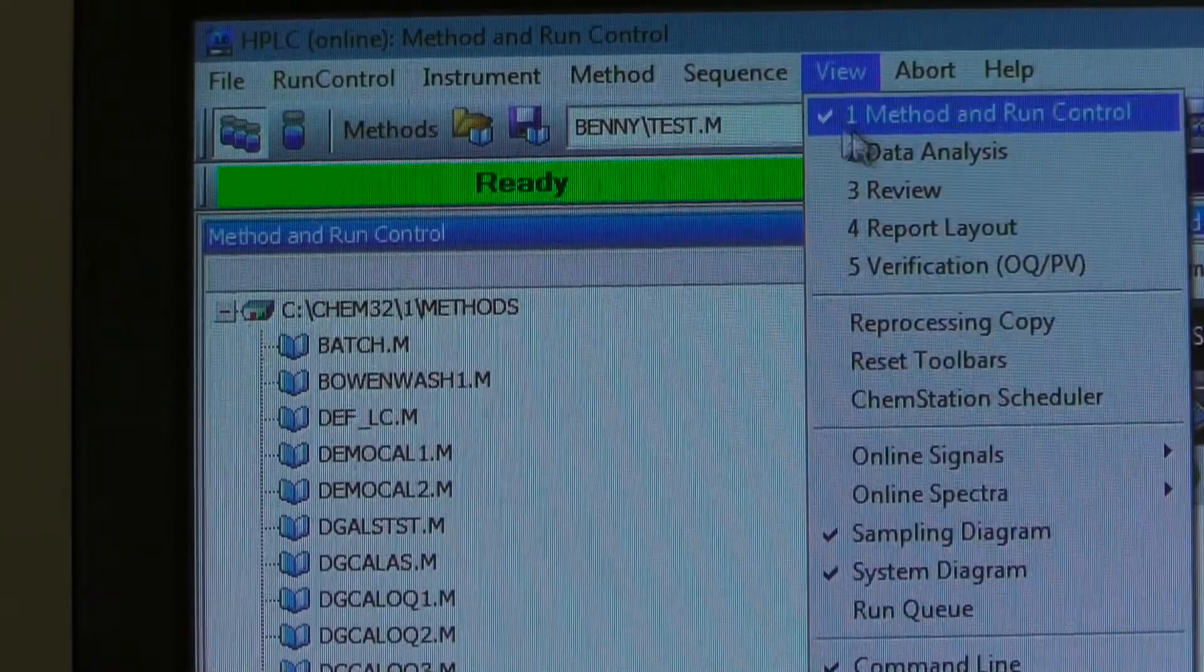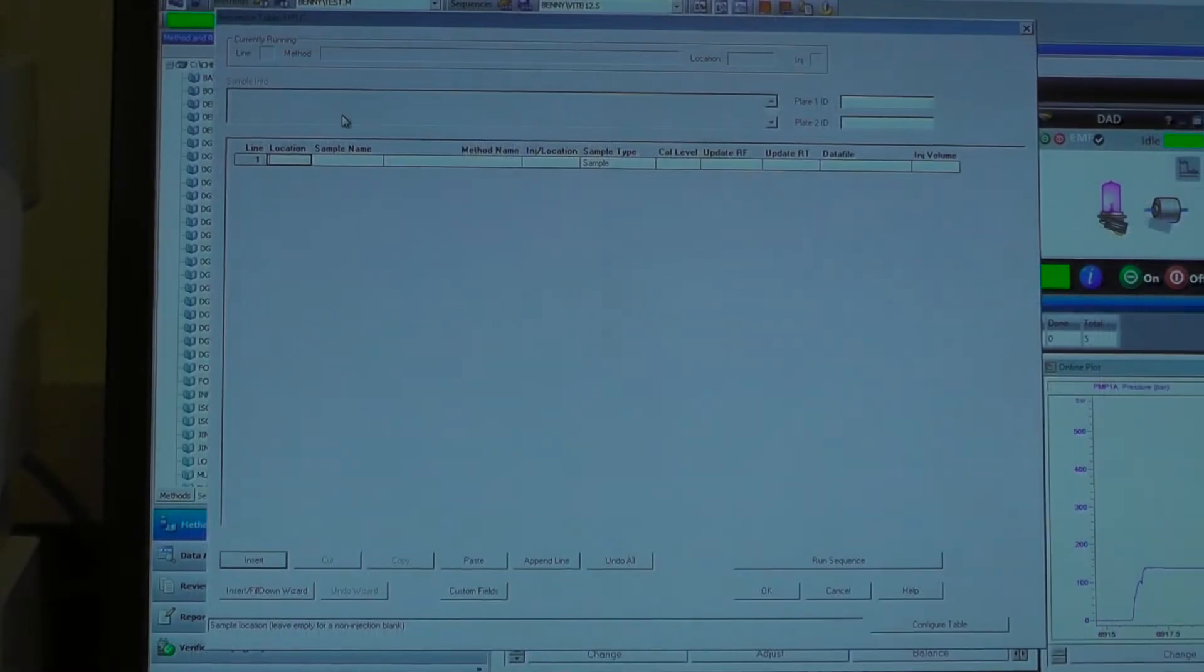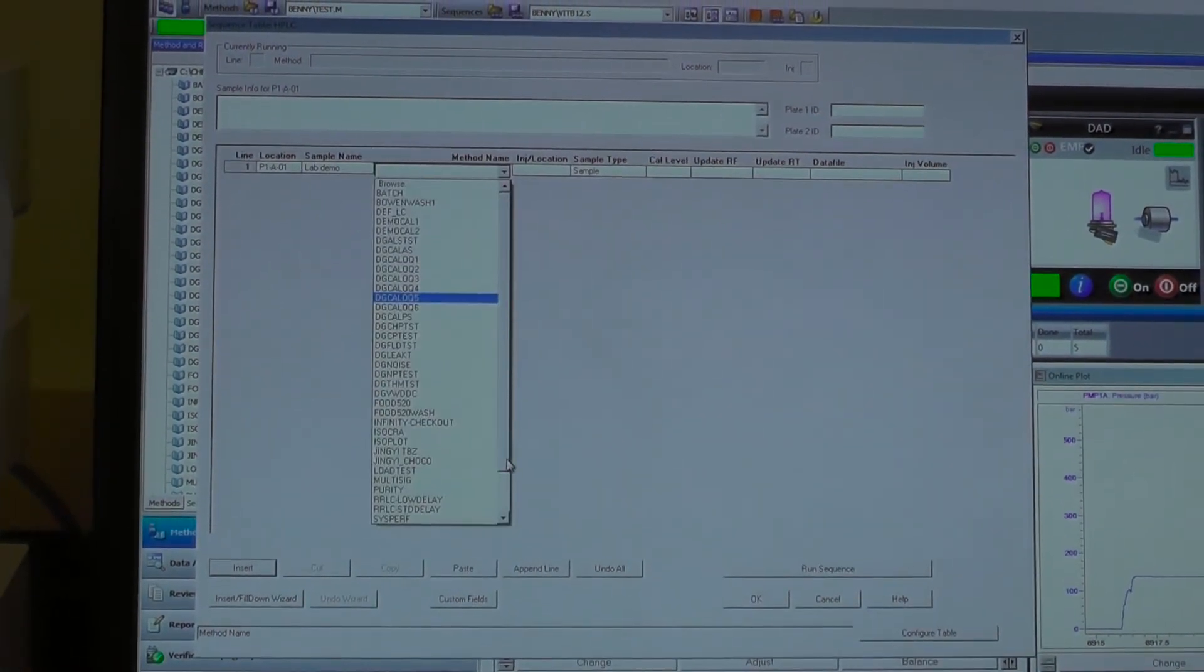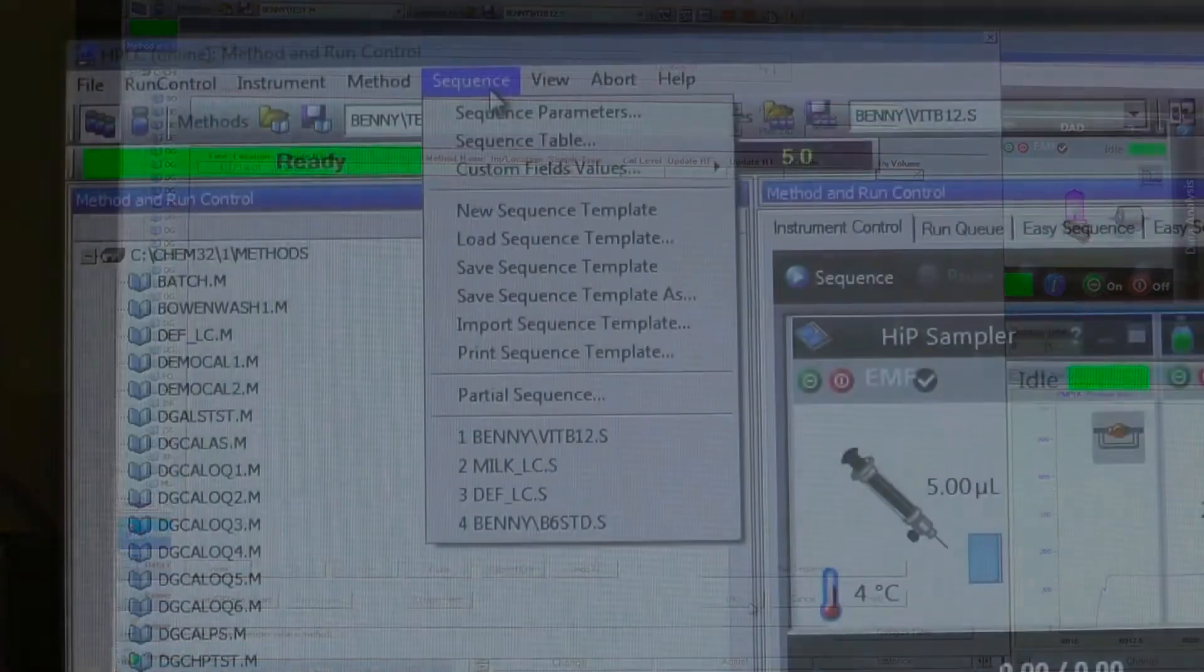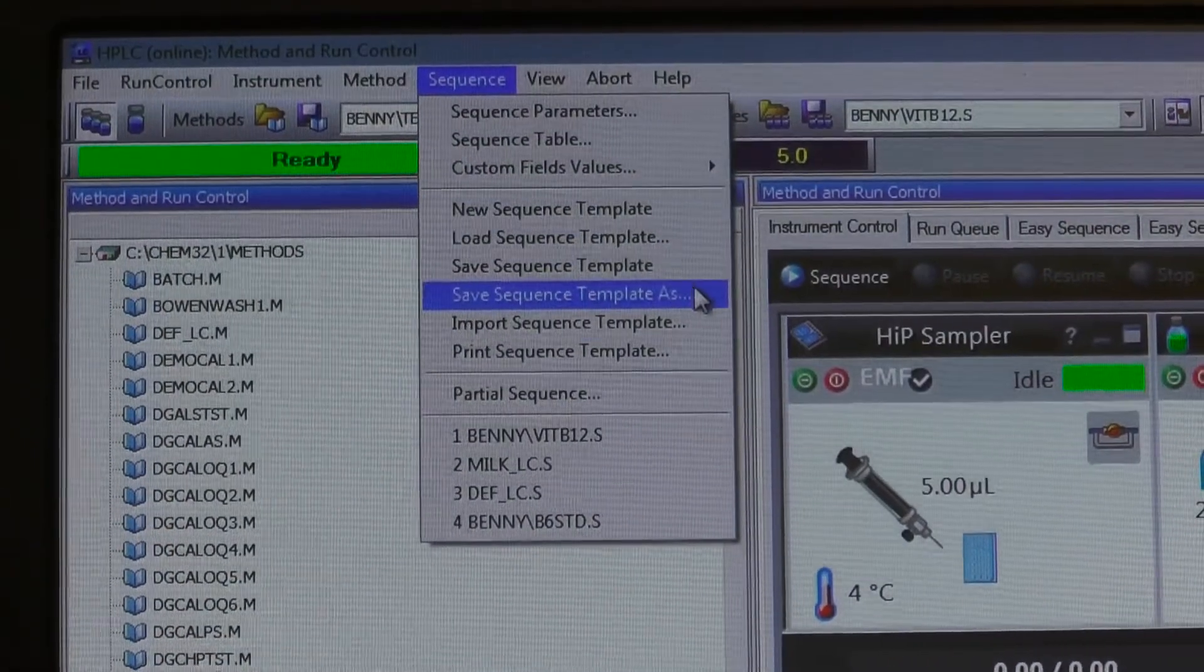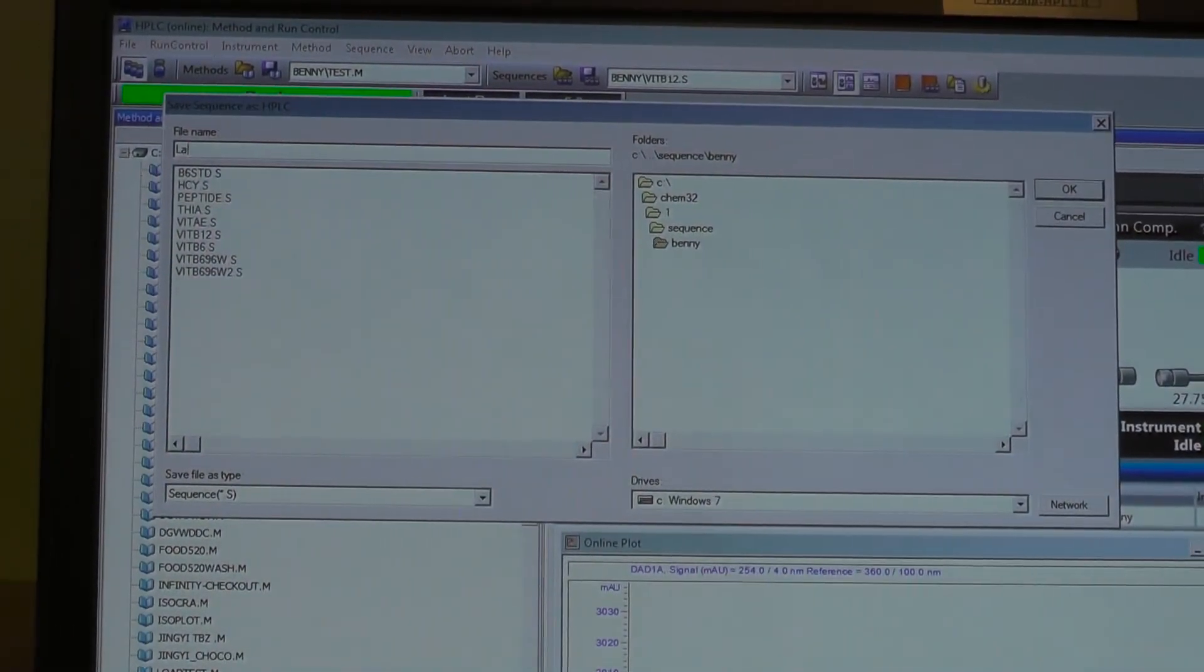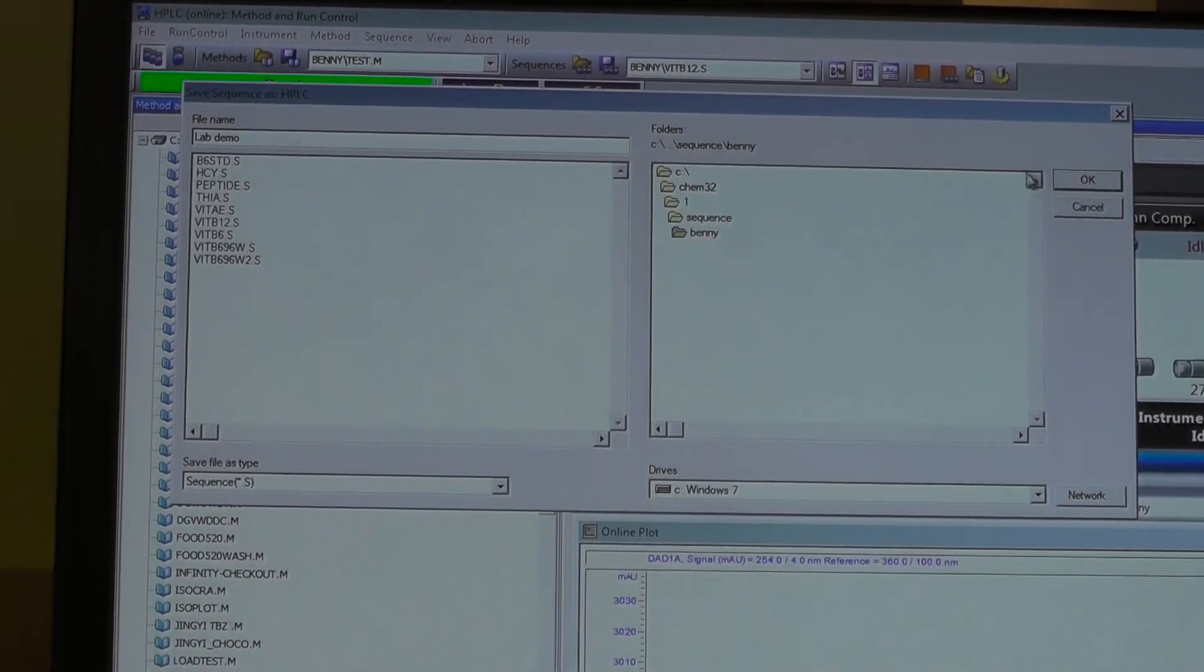Click on Sequence and then Sequence Table. Record the position of your samples here. Remember the plate closer to us is plate 1. Select Save Sequence Template As and store the Sequence Table in the designated folder, so that next time you can easily reload your sequence template in the future if needed.